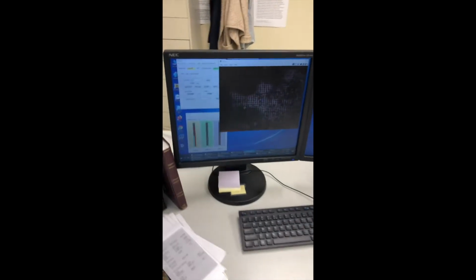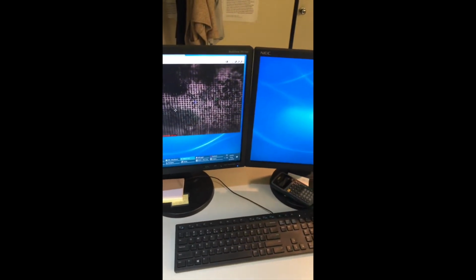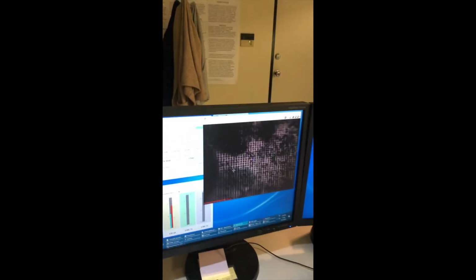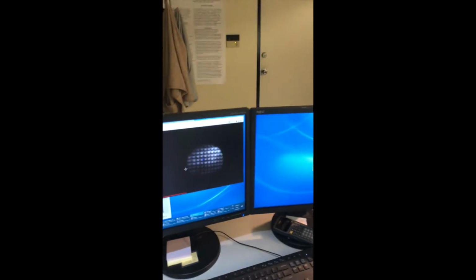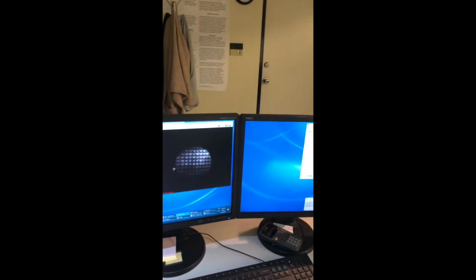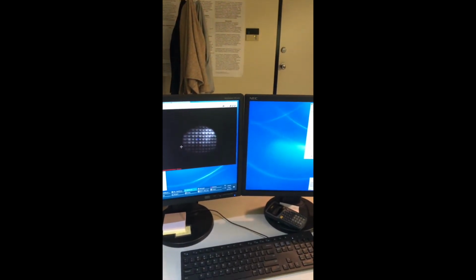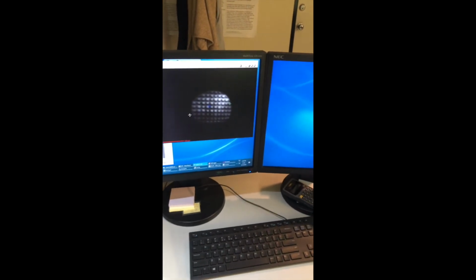Here you can see the light microscope image of a sample. It's an aluminum plate with a copper screen or grid squished onto it. And when we turn off that camera and let the ions hit it, what we see is a chemical map. I'm letting only aluminum ions hit our detector, and I said it's an aluminum plate with copper screen on top. Well, wherever it's bright, there's lots of aluminum.